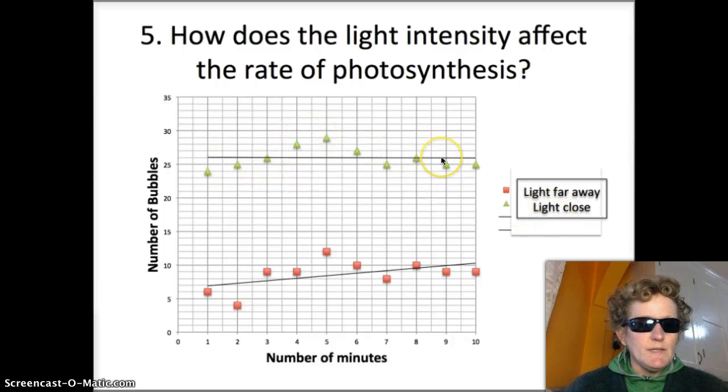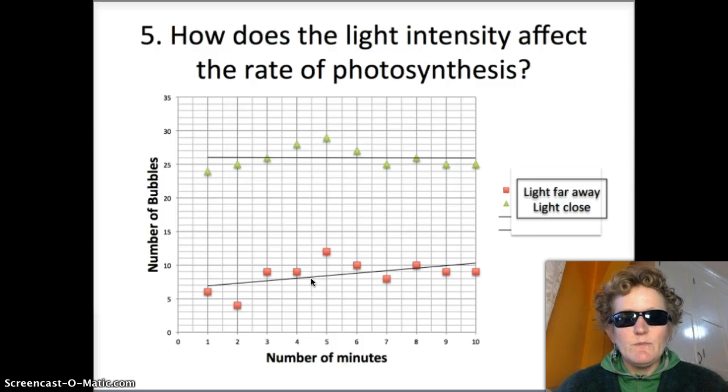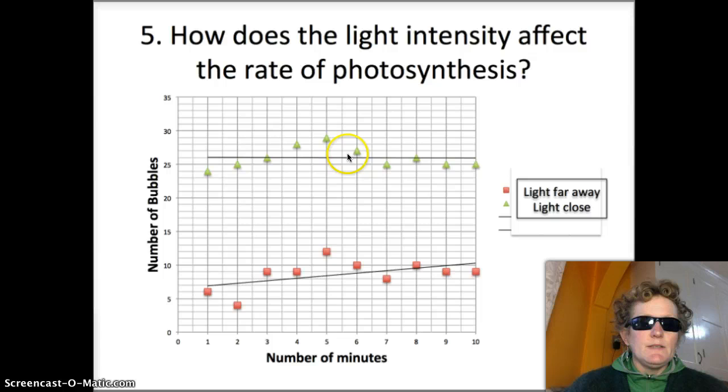So up here we can see that photosynthesis is going faster when the light is very close. In other words, if you have more light photosynthesis goes faster or goes at a higher rate. If you pull the light away and decrease the light intensity, the rate of photosynthesis goes down. Low light, low intensity. Of course in both the experiment here with the lettuce and the experiment in the virtual lab you have to include heat as a variable as well. This is a hot test tube full of plants and this is a cooler test tube.